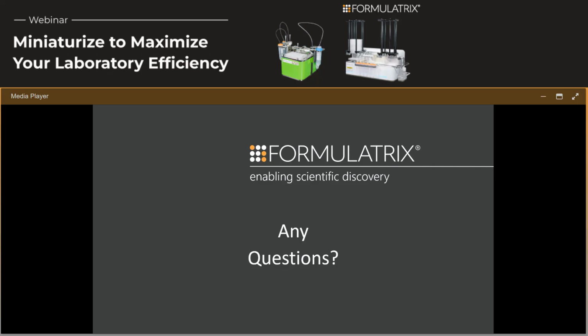Another question is, other than cost savings, what are the benefits of reaction miniaturization? So a major benefit is that one can perform more replicates of an experiment, providing more data points to improve the data quality. It also helps to increase the throughput of the experiment as smaller volumes can better optimize microplates. Moreover, miniaturized assays have become more automation friendly and total waste production is considerably reduced.